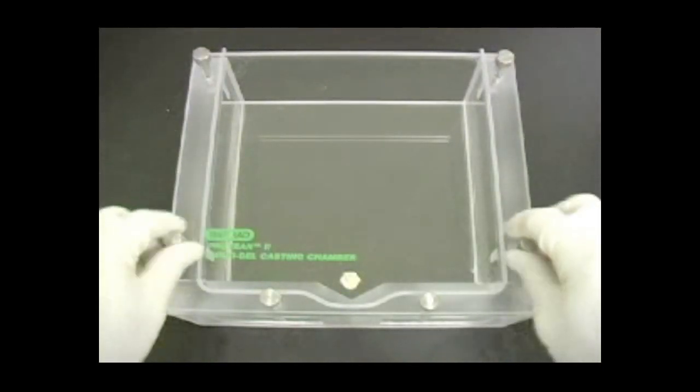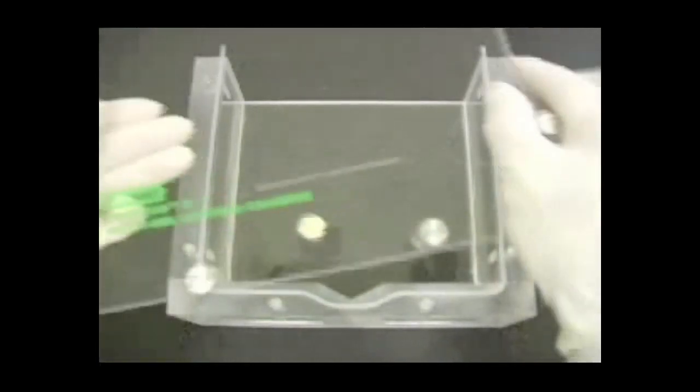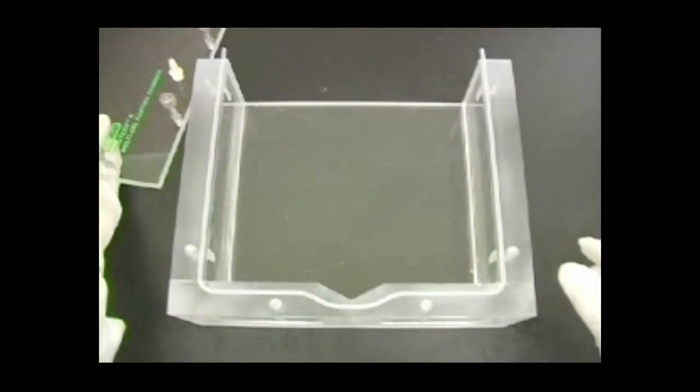Set the casting chamber face up on the bench top. Loosen the thumb screws and remove the sealing plate. Determine the number of gels you will be casting.